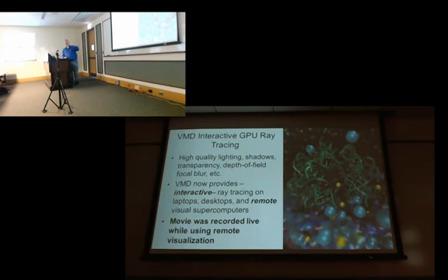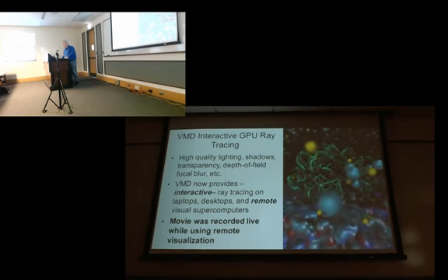And so you can very easily interactively adjust the scene however you want, and change the perspective, move the camera in and out of the scene, all that kind of stuff.